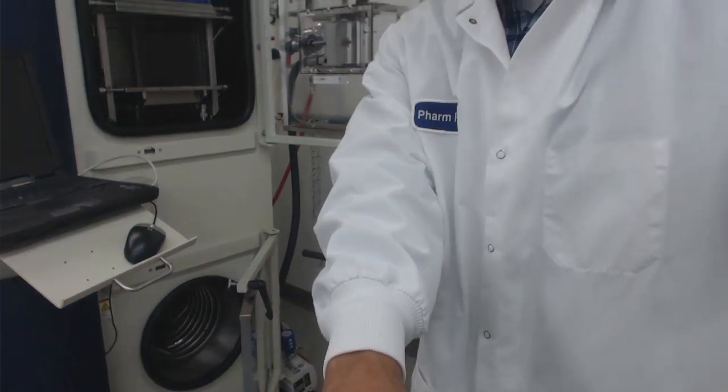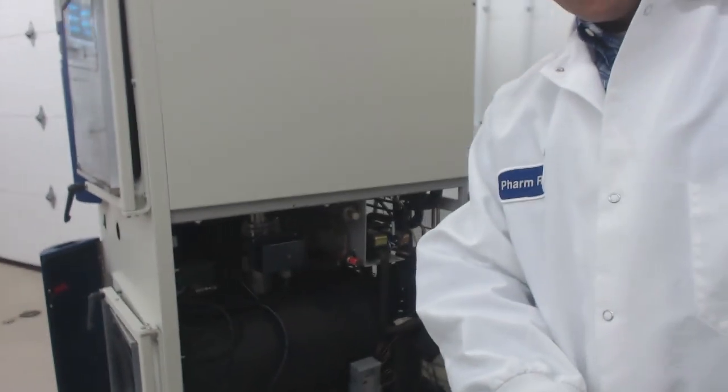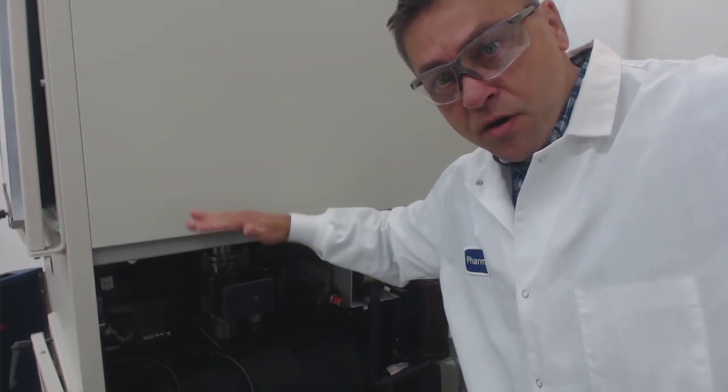How does that water vapor get from the chamber down to the condenser? This is an important thing to remember. Not all lyophilizers are created the same. These lyophilizers have what's known as a spool piece in between the product chamber and the condenser. That spool piece is like a neck. I'll rotate you around to another lyophilizer that I have with the side panel removed. This neck piece right here between the chamber and the condenser, that is the spool piece.